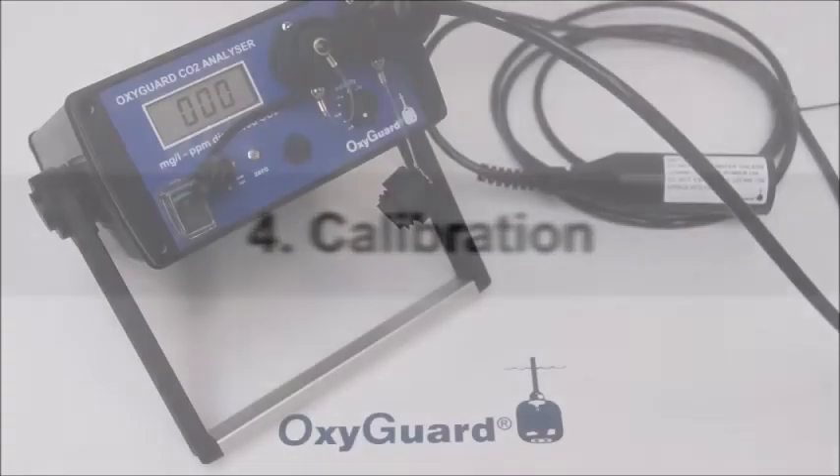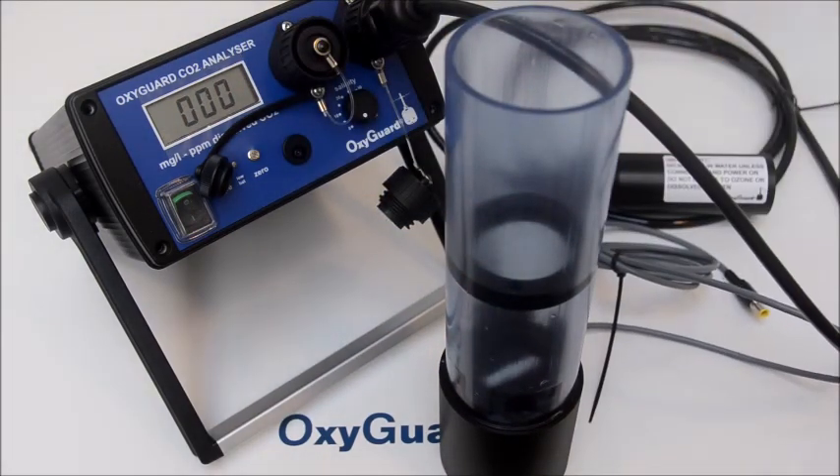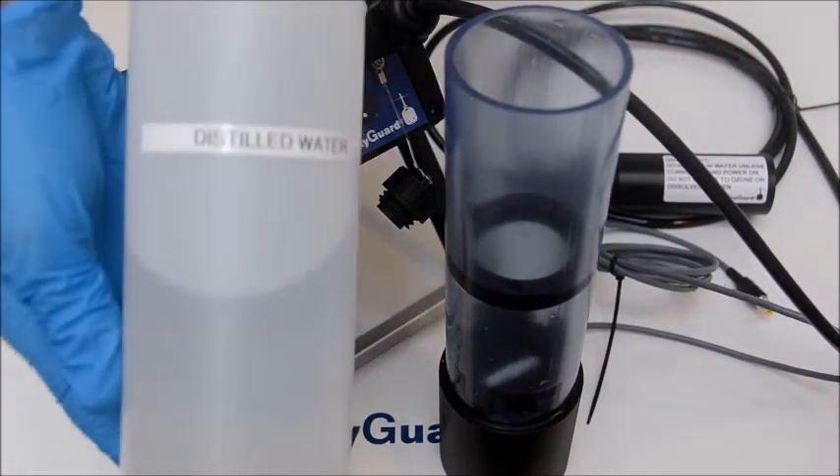We are now ready to proceed with the calibration procedure. Pour some distilled water in the beaker — water should reach the upper part of the black ring in the middle of the beaker.